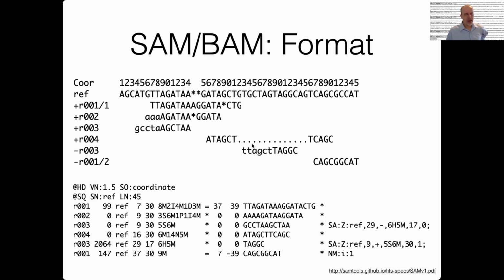I don't think that SAM files actually care about case. I'd have to double check the specification, but I don't think they care about case, and usually they'll just show your sequence in uppercase. I think that's right.